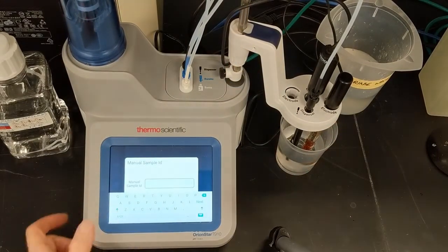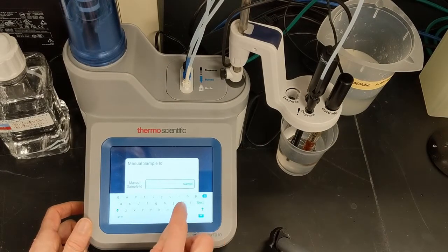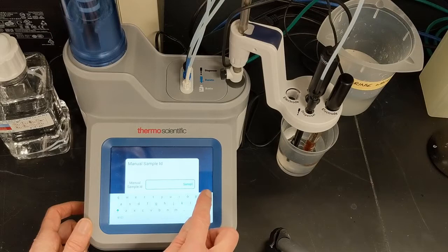Since I've chosen the Manual Sample ID option, I can type in the name I want saved in the log. I'll use Sample 2.